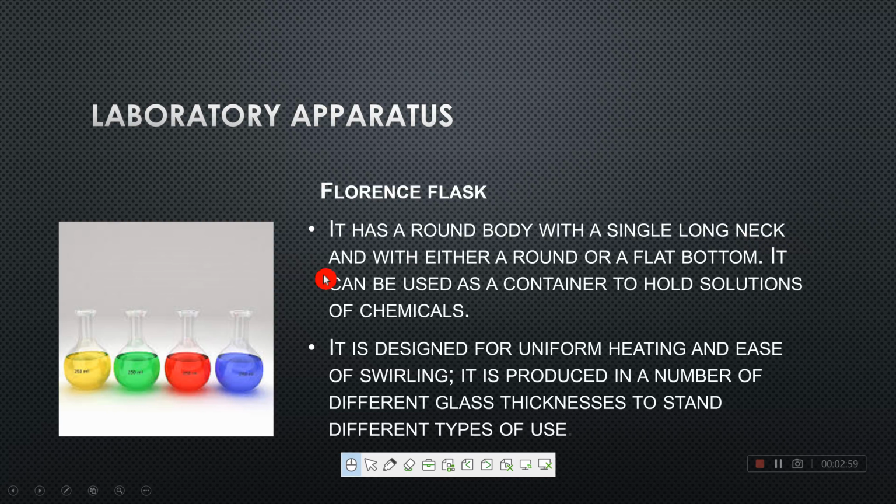Alright, so it can be used as a container to hold solutions of chemicals. It is designed for uniform heating and ease of swirling or stirring the solutions. It is produced in a number of different glass thicknesses to stand different types of uses.